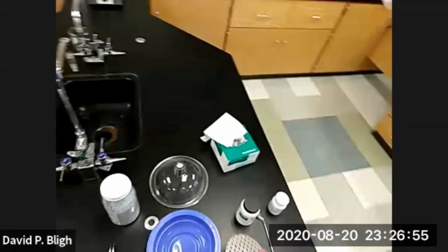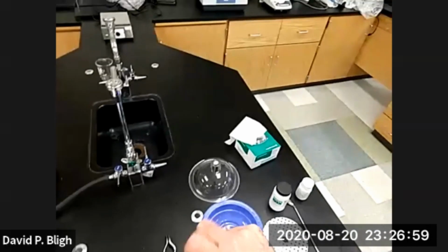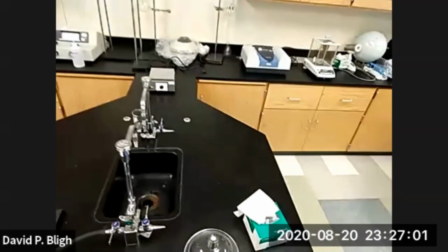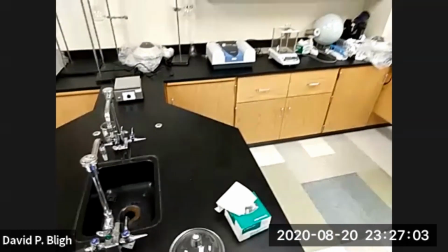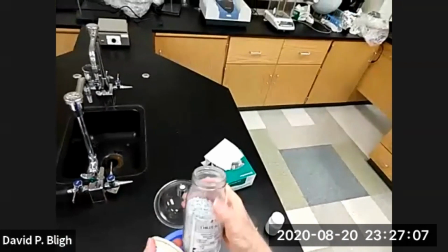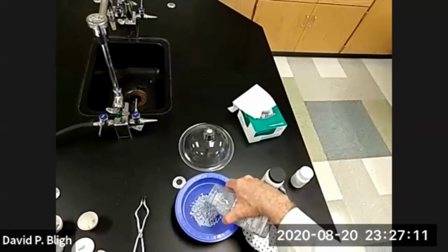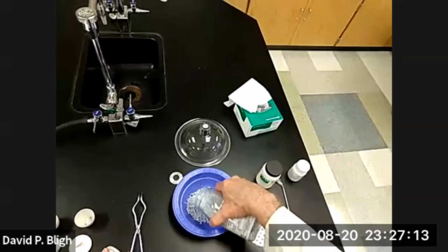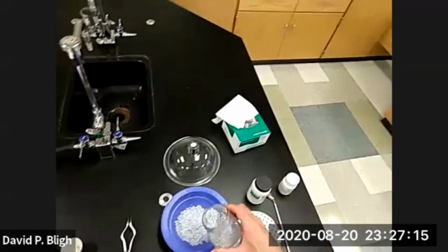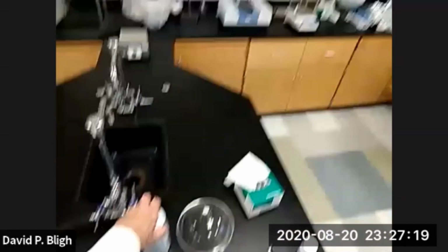Okay, so we need a desiccant, something to absorb the moisture. And if I can get this thing open, it's not cooperating very well. There we go. This is Drierite. It's basically calcium sulfate. And when calcium sulfate absorbs water, it becomes gypsum.